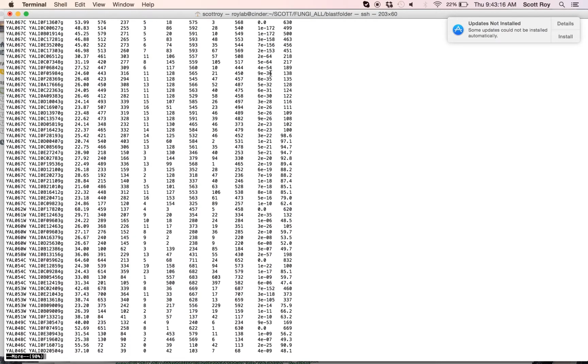And the way we would do that, so we'll go back to M8, so we don't have all that extra stuff to look at. And the way we would do that is with an E value, so -E, and then whatever we want our worst E value to be, our cutoff for an E value. So we could use, for instance, 10 to the -5th would be like this. And let's run that, see what it looks like. And so what we see, notice the first thing is that really high score that we had with the score of 0. All the ones before it that had low E values or bad E values have been eliminated, and now you can see we only see these better hits.